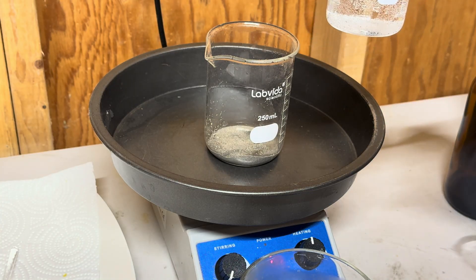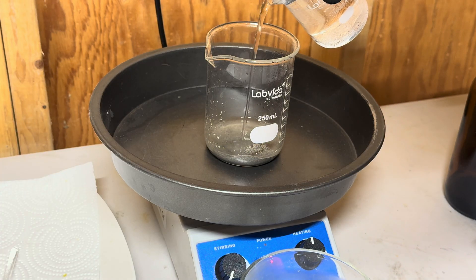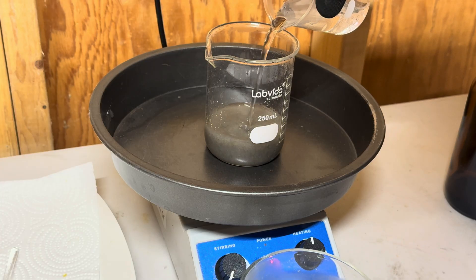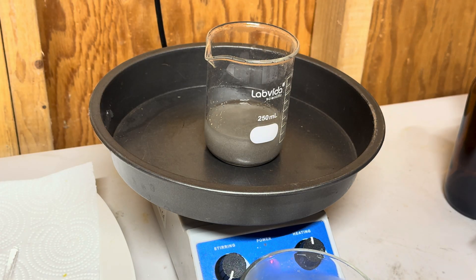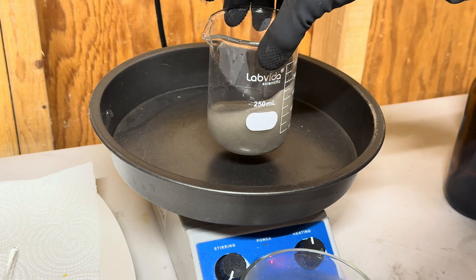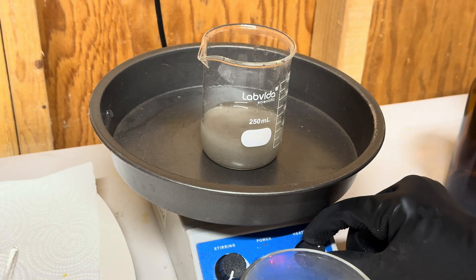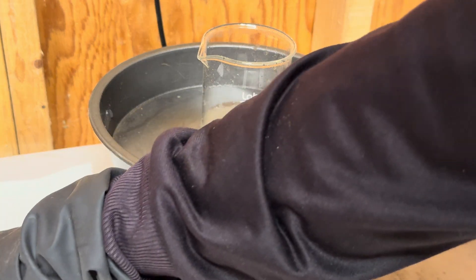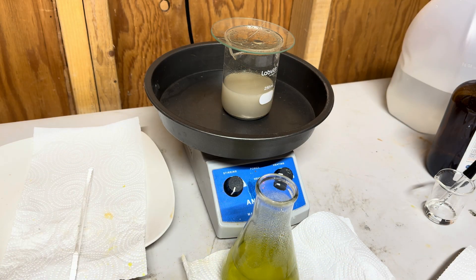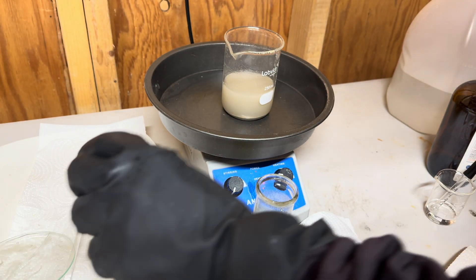We will now add in our 100 milliliters of nitric acid for our nitric acid wash. We will pour our nitric acid into this flask and we will use the solution for another project.